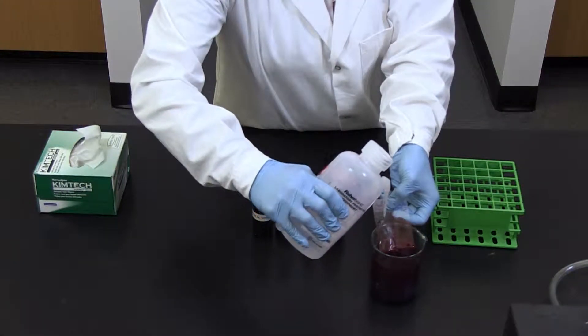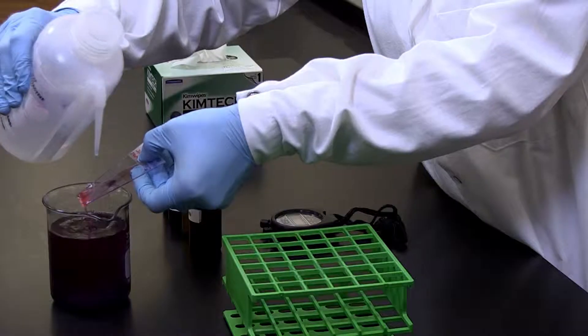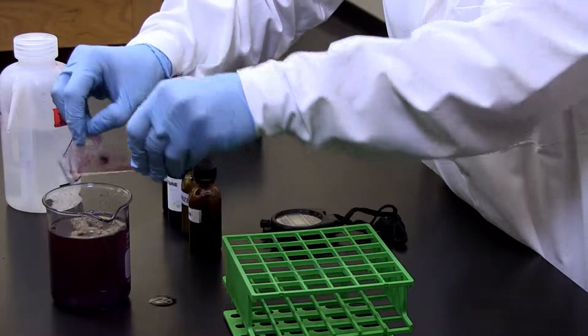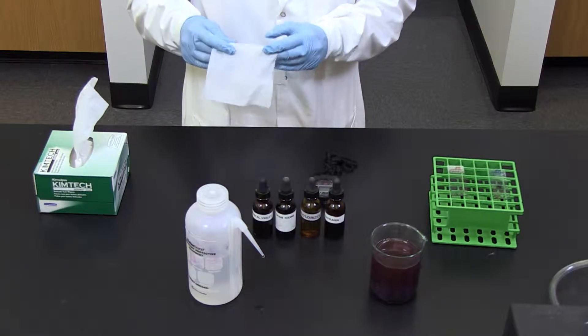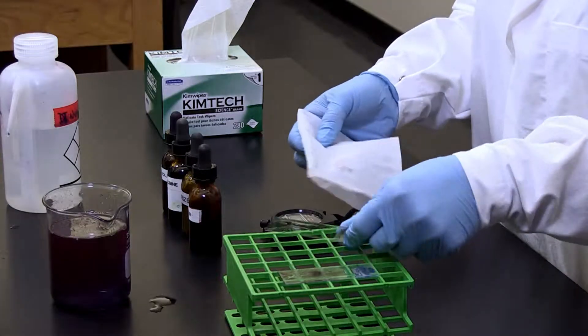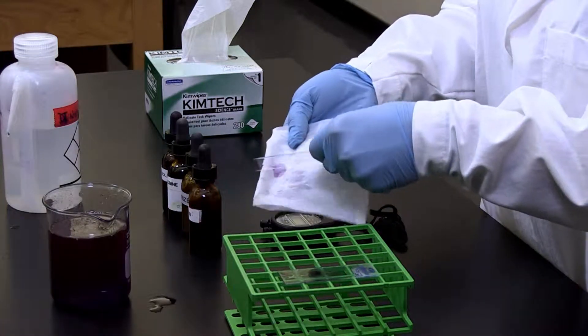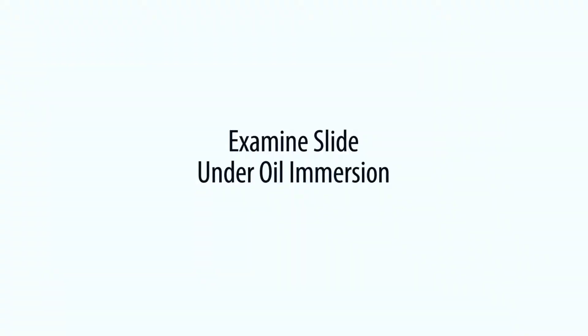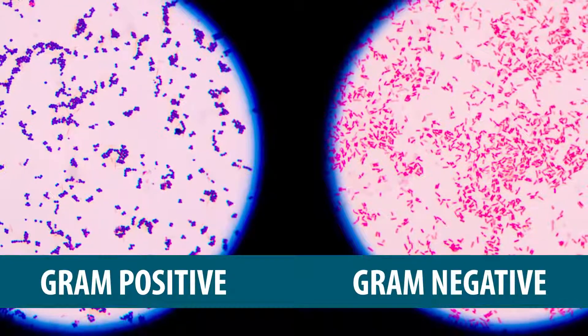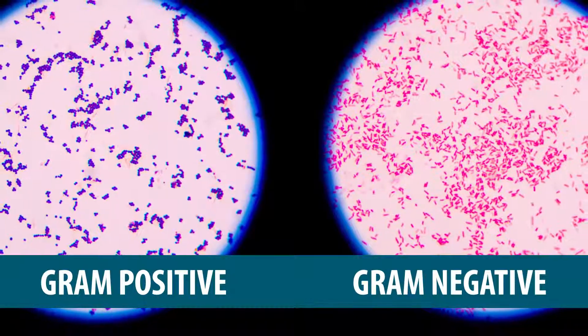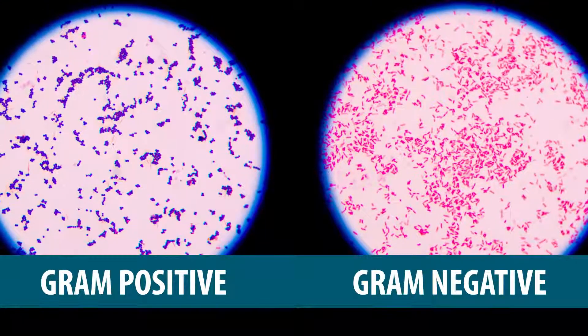Eight, rinse the slides gently with deionized water to remove excess safranin. Nine, blot the slides with bibulous paper to remove excess water. And ten, examine the slides under oil immersion. The S. aureus cells staining purple are designated gram-positive, while the staining pink E. coli cells are deemed gram-negative.